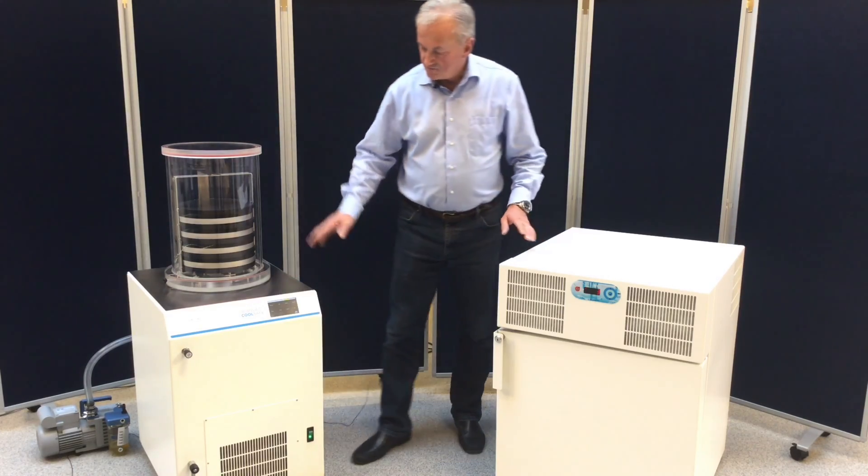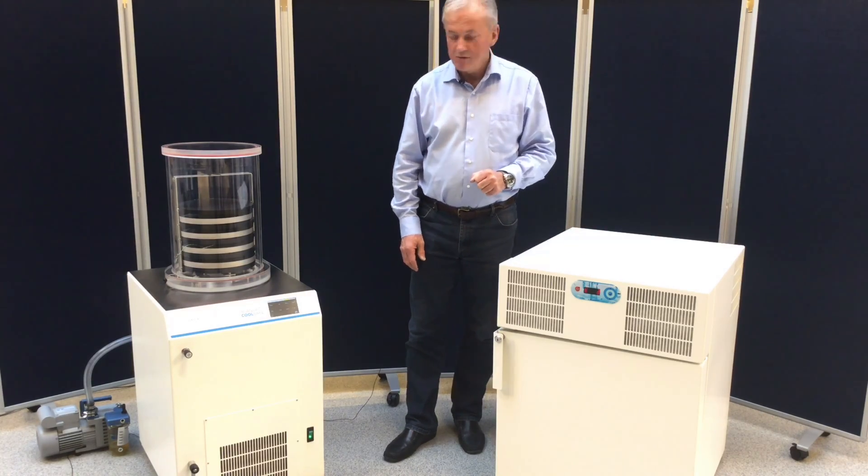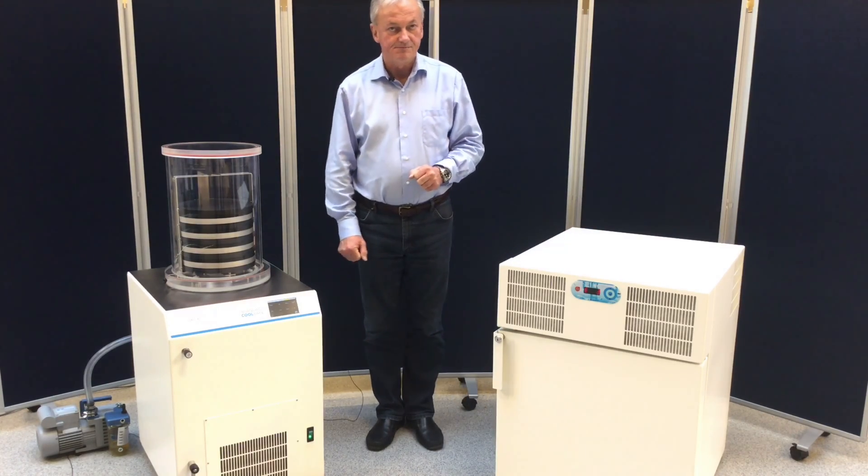So this is a combination of our freeze dryer and our freezer, where you can use the freezer for pre-freezing the sample before entering into the freeze dryer. Thank you very much.